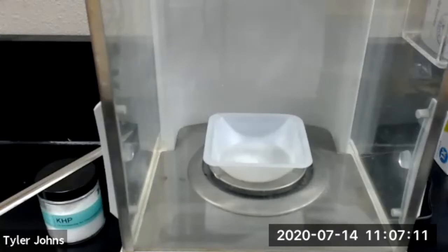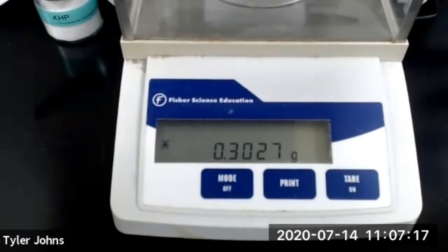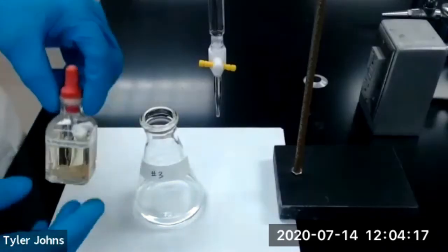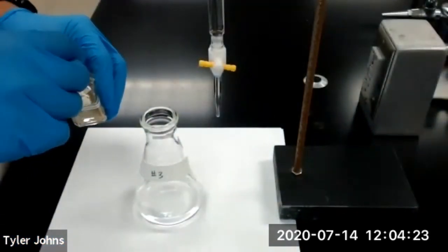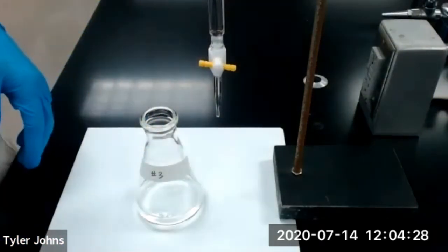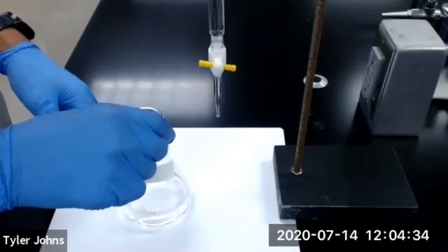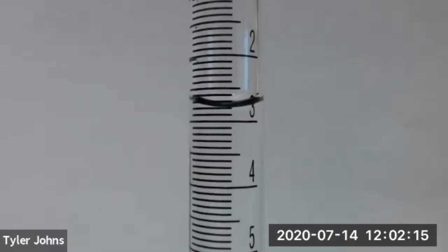The mass of KHP that we will be using for trial number three is 0.3027 grams. We now need to add three drops of our 1% phenolphthalein indicator to our Erlenmeyer flask for trial number three. We are now ready to begin titration for trial number three. This is our initial burette reading for trial number three.